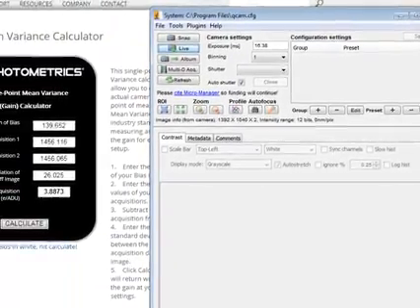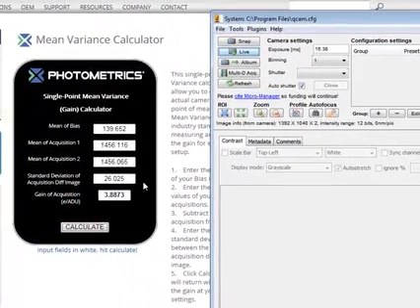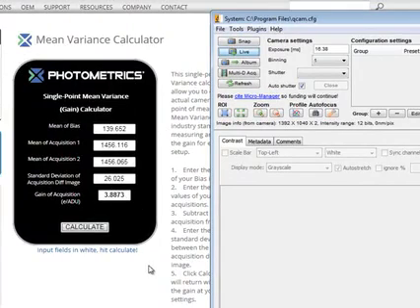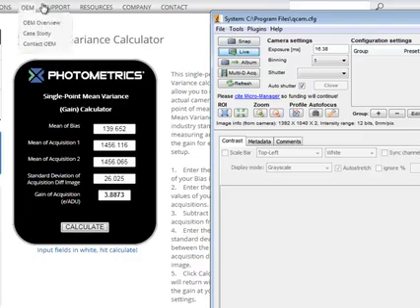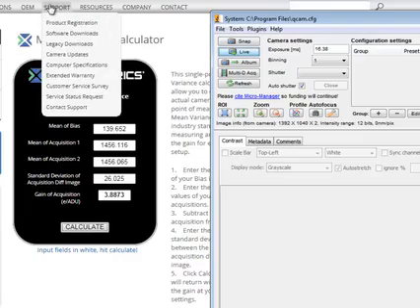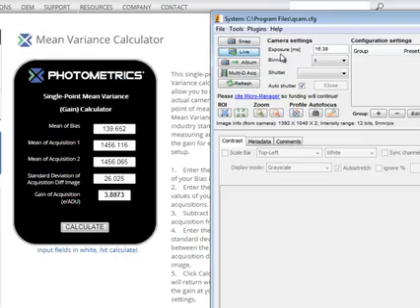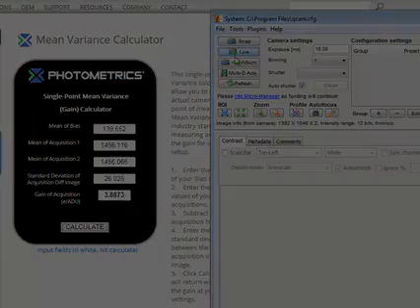We're pretty much good because now we know our electrons per grayscale. We can actually use that in our signal-to-noise calculator, but we'll do that in a separate movie. I hope that helps — thanks.